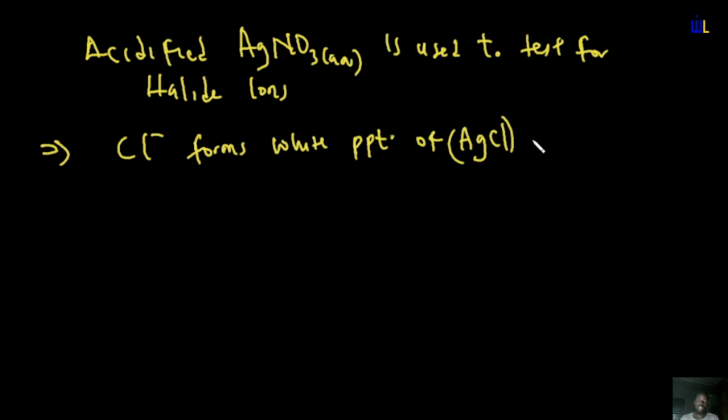Now, this white precipitate of silver chloride, after formation, will be dissolved in aqueous ammonia.